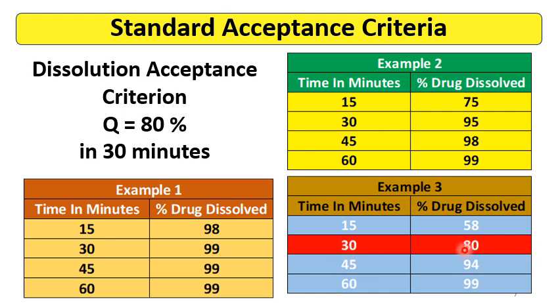So this type of formulation cannot be given a standard dissolution method criteria and the dissolution conditions. If you have given standard dissolution conditions, that is, basket RPM will be 100, paddle will be 50, so something you have to do here to increase this dissolution, because if it is 80%, then as per the generalized criteria of biobatch minus 10% dissolution limit, it will be 70%.